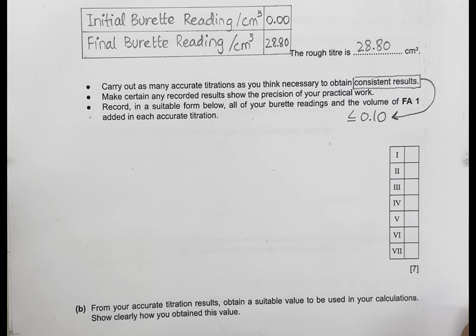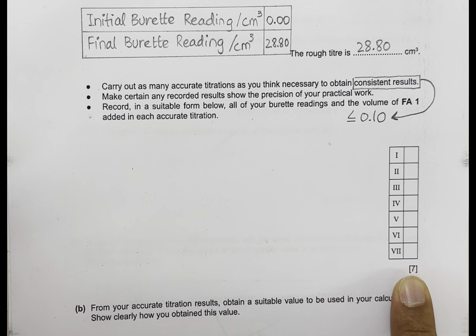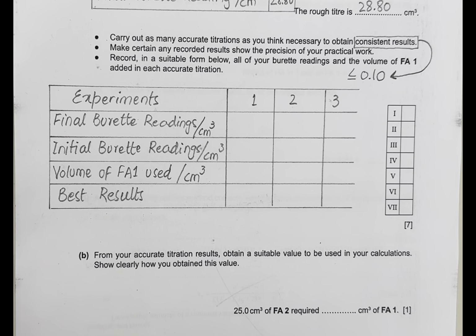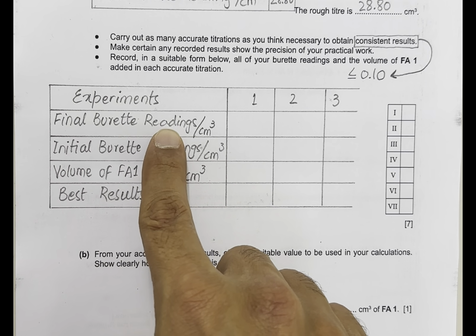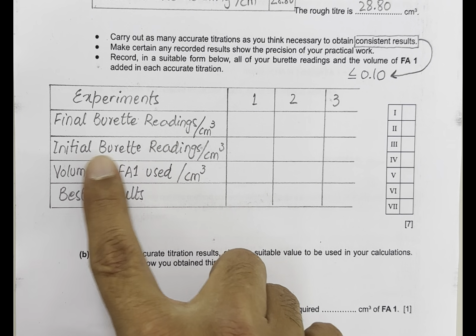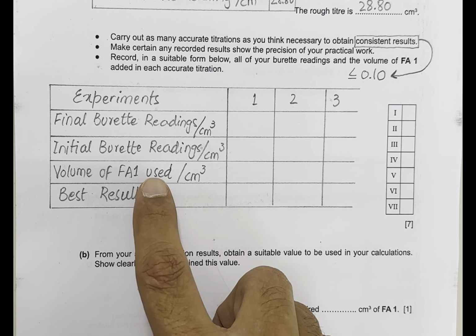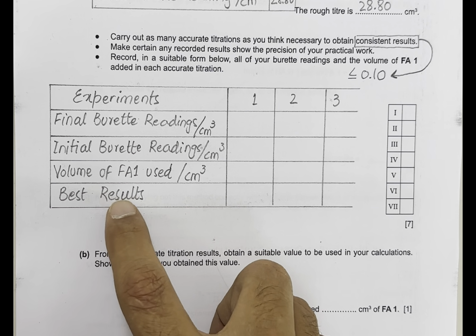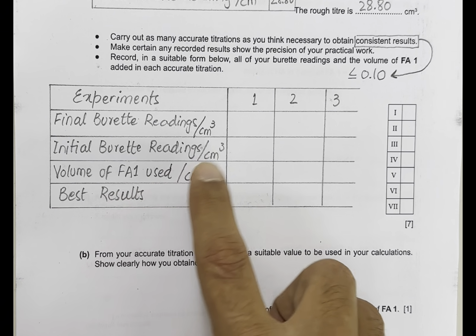So let's repeat this, but before that, let me draw a table and see how these 7 marks are allocated in this table. So here is the comprehensive table which must be holding final burette readings in centimeter cube, initial burette readings in centimeter cube, and the volume of Fa1 used in centimeter cube, which can be calculated by subtracting these 2 values, and the best results. Now let's start for the first accurate titration.